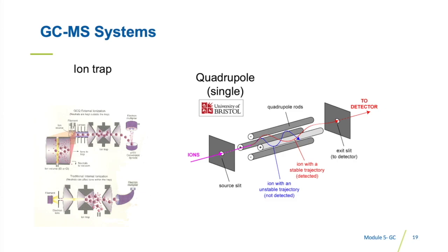This type of detector is highly selective because it will only allow one mass-to-charge ratio through, but we must bear in mind that more than one chemical compound may produce ions of this mass-to-charge ratio. Combining two quadrupoles and a collision chamber between them increases the selectivity even more, which is why this combination is considered to provide sufficient information for confirmation of identity.